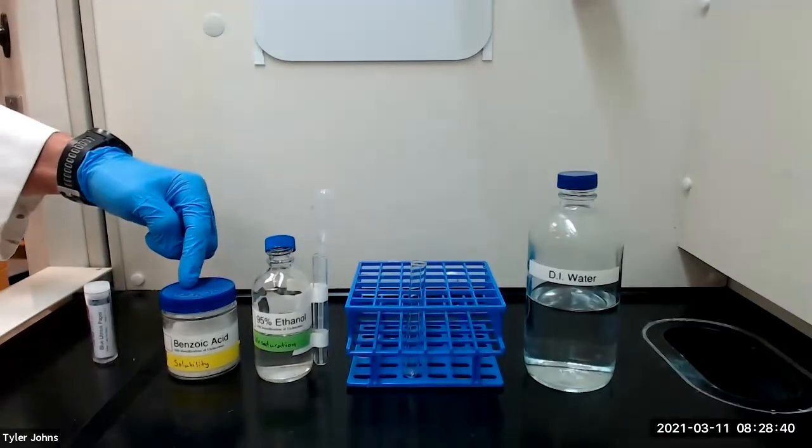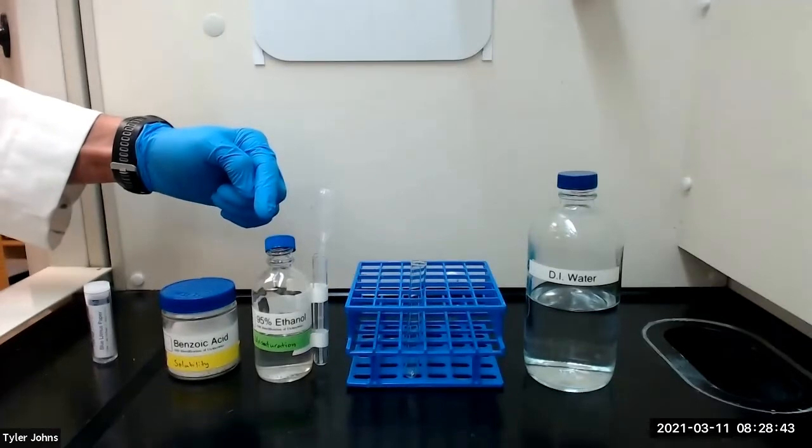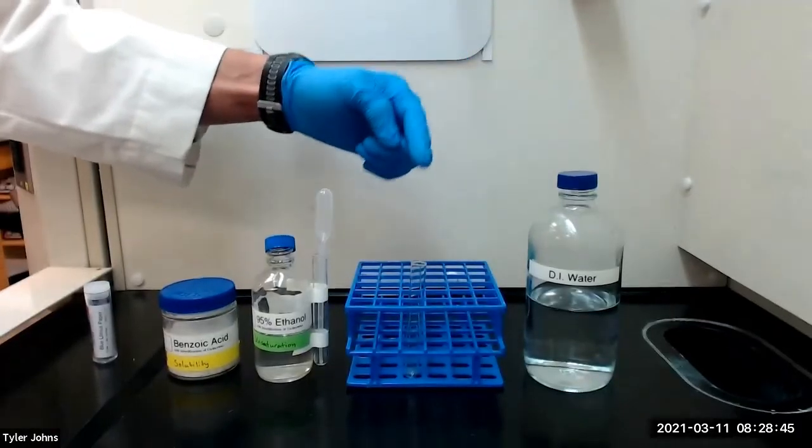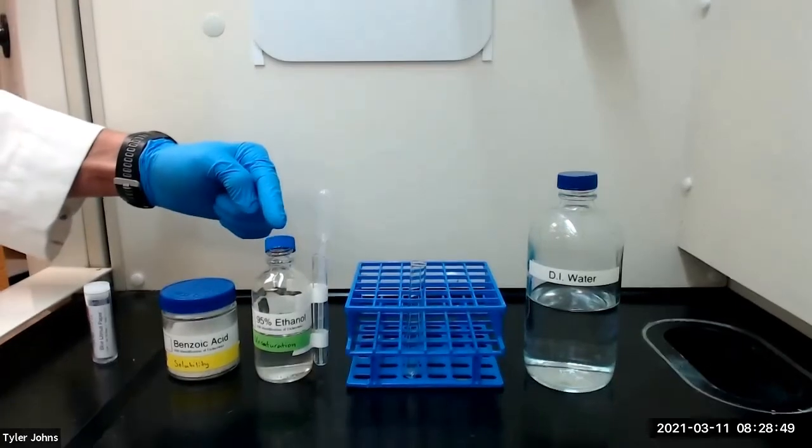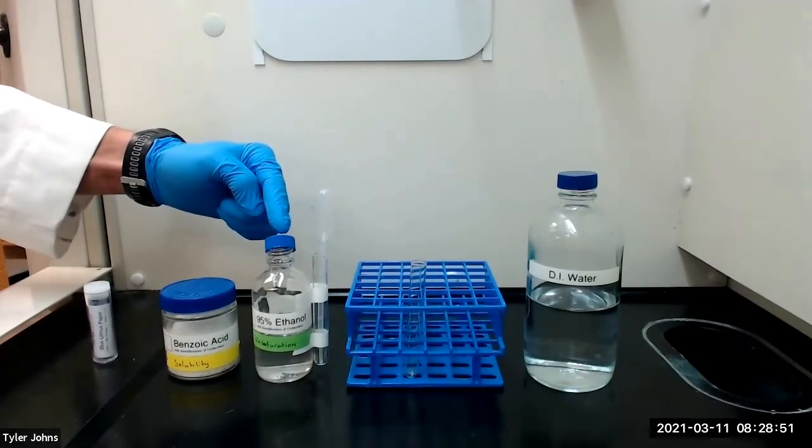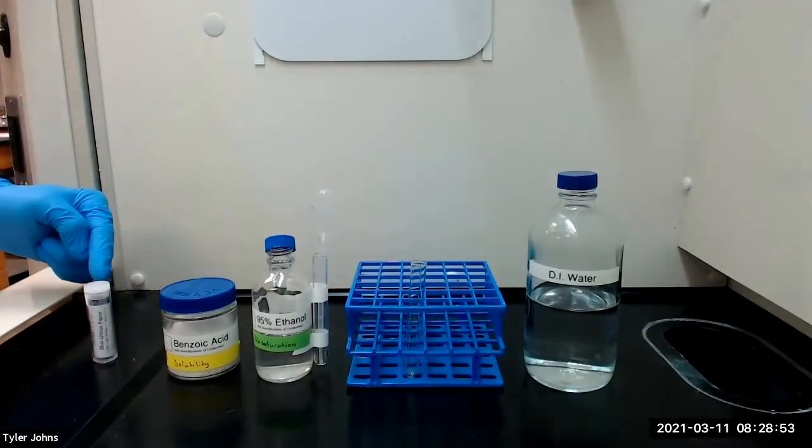We will first dissolve the compound in a test tube with the alcohol, and then we will add water until the solution just becomes cloudy. We will then clarify the solution by adding a few drops of the alcohol and test the pH using pH paper.